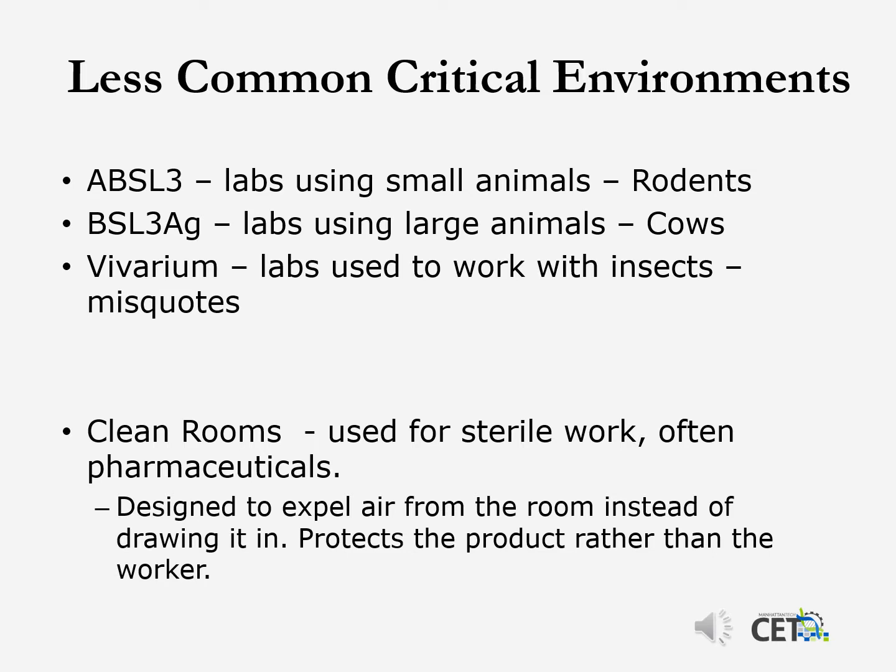Clean rooms are different. Clean rooms have air flow that is moving out of the room to protect the sterile areas in the room from contamination. That's the exact opposite of a BSL-3. BSL-3, the air moves into the room, keeping the contamination in the room. Clean rooms, air moves out of the room, keeping the room sterile.